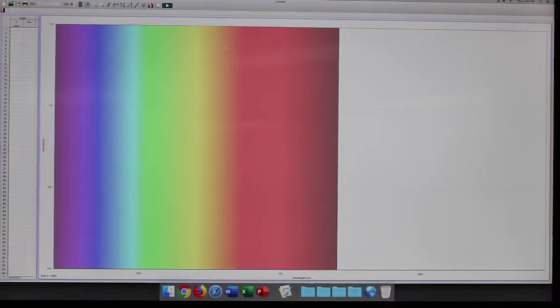So that's all visible light, and we're looking at visible light when we look at pigments because pigments are what we see within that visible light. Now when we think about absorbance, there are 3 different types of light. There's absorbance, there's reflectance, and there's transmittance. Transmittance is when light passes through an object. When you have a see-through object that may be colored, the color of that light is due to the wavelengths of light that are passing through the object to your eye.